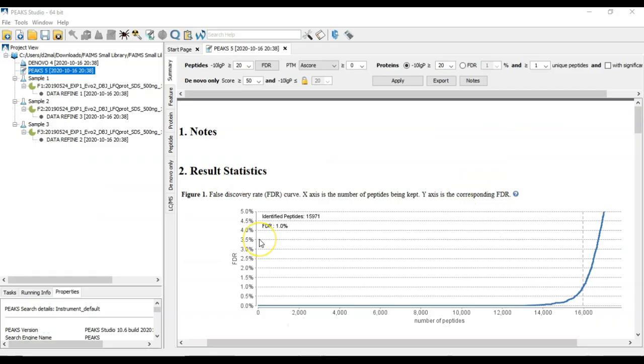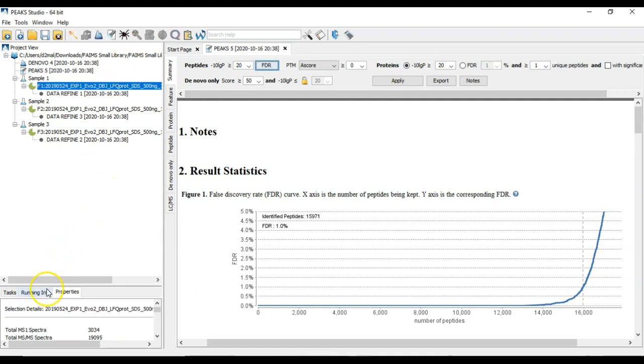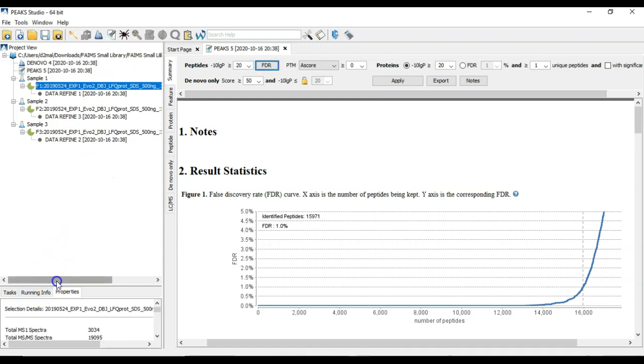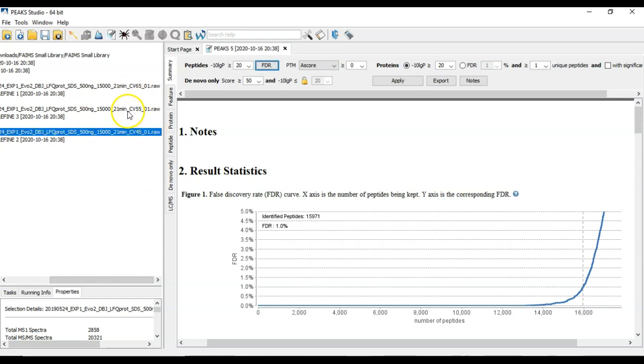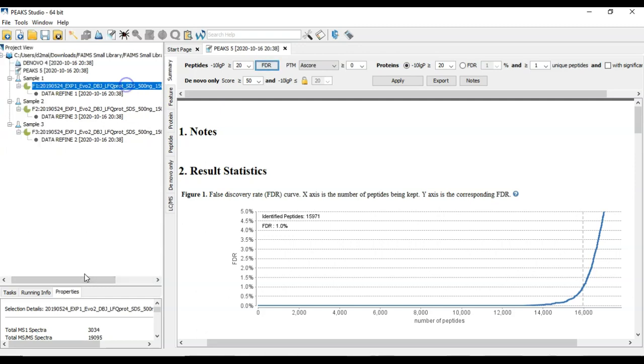Let's take a look at a DIA and ion mobility setup. In this case, we're going to use FAMES data. In this project here, what we have is three different data files with three different compensation voltages, or CVs, that have been loaded in, in order to get the most coverage of the proteome as possible. In this case, we're only using a subset of the original data.